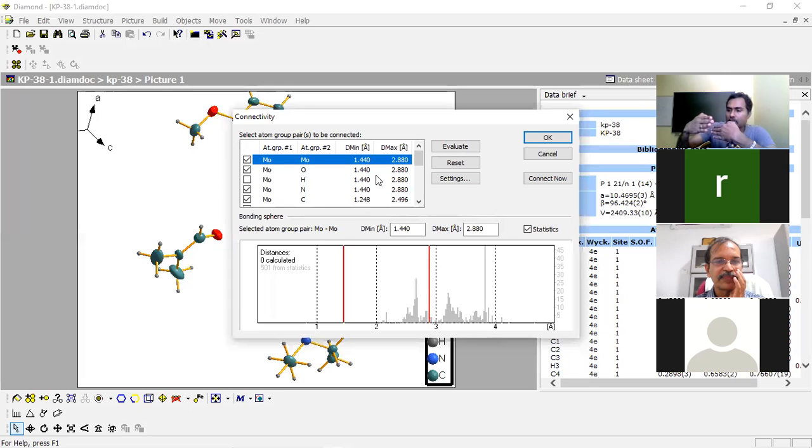So then what will happen is when we refresh it or obtain the nearest polyhedron, it will search and find out within the distance and bring all the other atoms which are within the range. So from that we can find out the residue of that one. Then we can get the whole molecule from there. So this is the technique that we are using here. So for that, we have to increase the distance. Usually we will not get a much higher carbon-carbon distance, not around 4 or 3 angstrom. It will be 1 point something. We can see the carbon-carbon distance here.